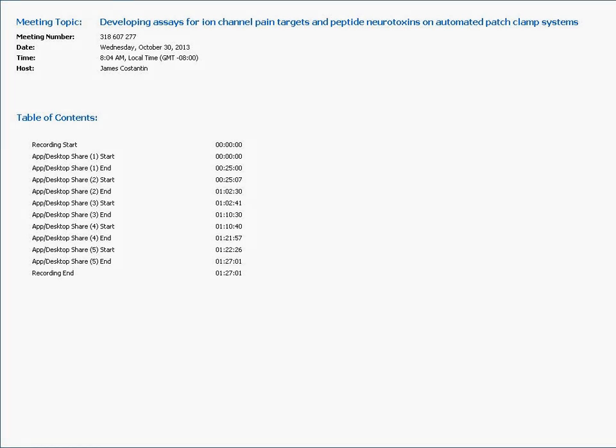And derivative 4, you see the same trend where it's pretty potent again here. And with the apparent IC50 of about 1 micromolar, 0.96 micromolar. And the last derivative we tried out, it also inhibits. So far we're on a good track here where all these different derivatives are working. And this one gave us an IC50 of 1.39 micromolar.